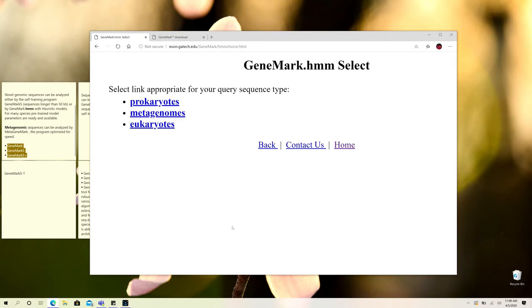You would like to see what kind of genes and at what region the genes are available within your genome. It can be a prokaryote, eukaryote, bacteria, viruses, phages, or plasmids.